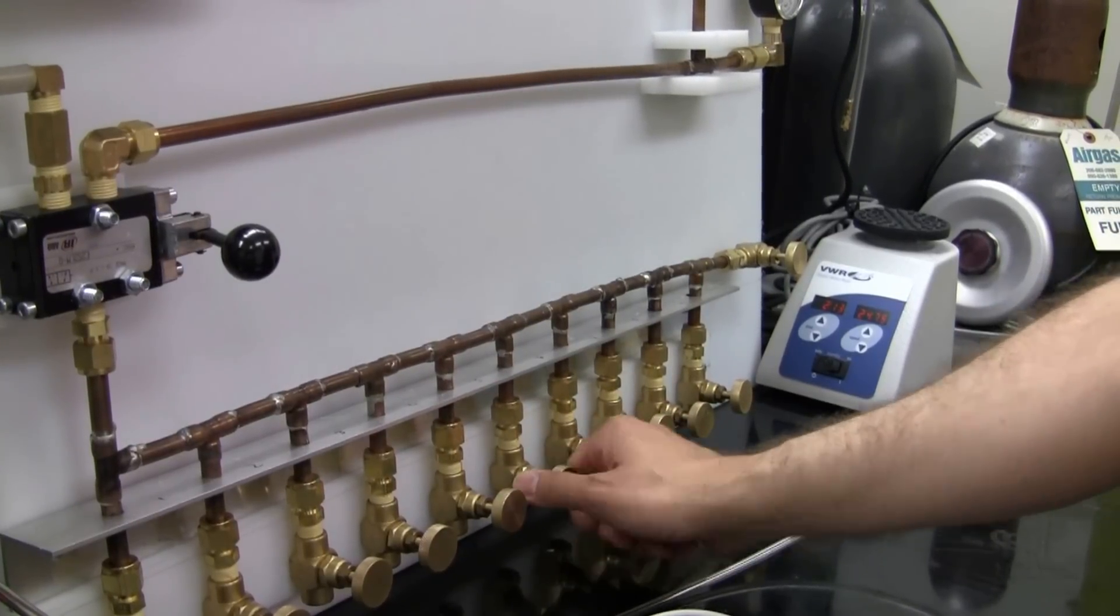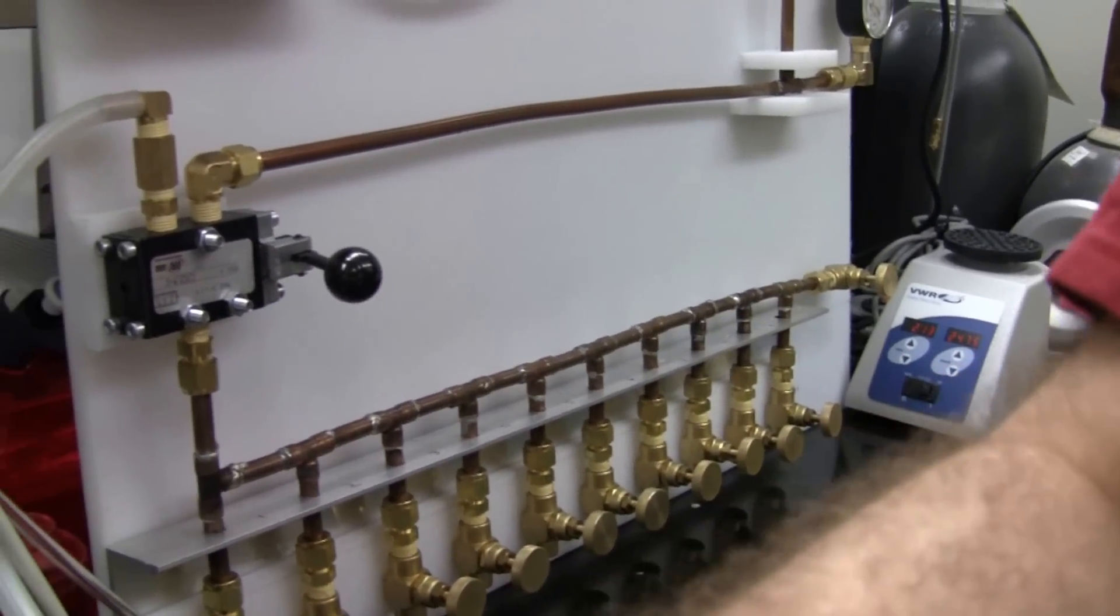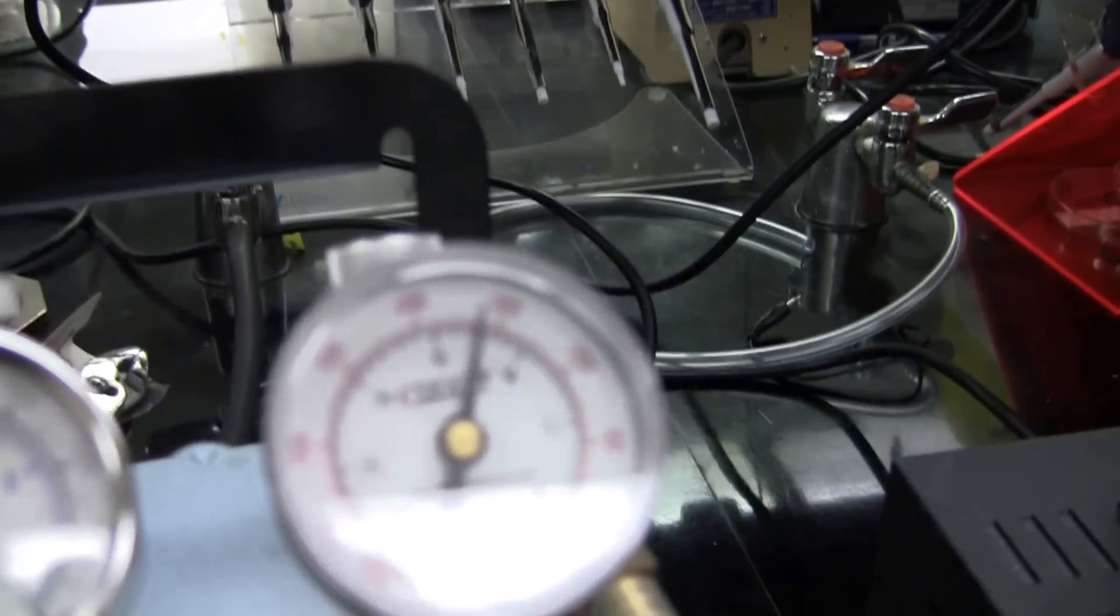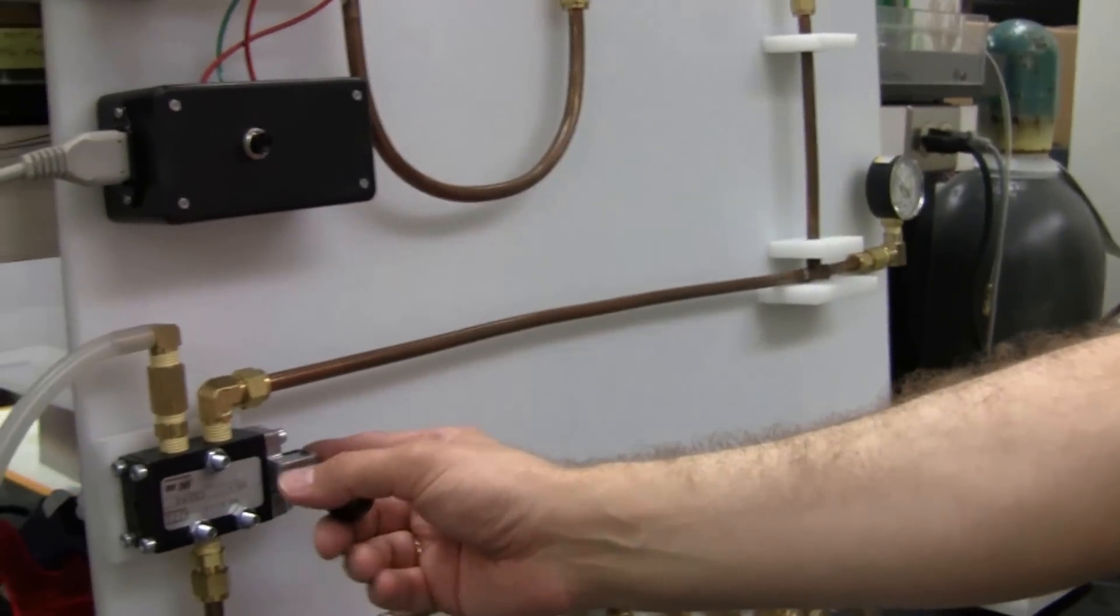So, again, once the system is equilibrated, you will notice here that the pressure reaches maximum attainable on the vacuum pump. And then you can repeat the process.